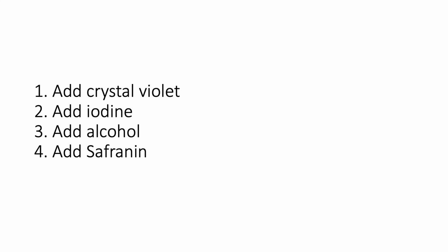So to summarize, when we have gram-positive and gram-negative bacteria, when we add in the crystal violet, which is purple in color, it'll seep through the capsule, the cell wall, and the cell membrane into the cell for both gram-negative and gram-positive bacteria. Same with the iodine. But when we add in the alcohol, the gram-positive bacteria have a thick peptidoglycan layer. So the crystal violet and iodine are, in a sense, protected from the alcohol wash. So they don't get washed away from the gram-positive. But in the gram-negative, since we see the thinner peptidoglycan layer, the alcohol is able to wash away the crystal violet and iodine.